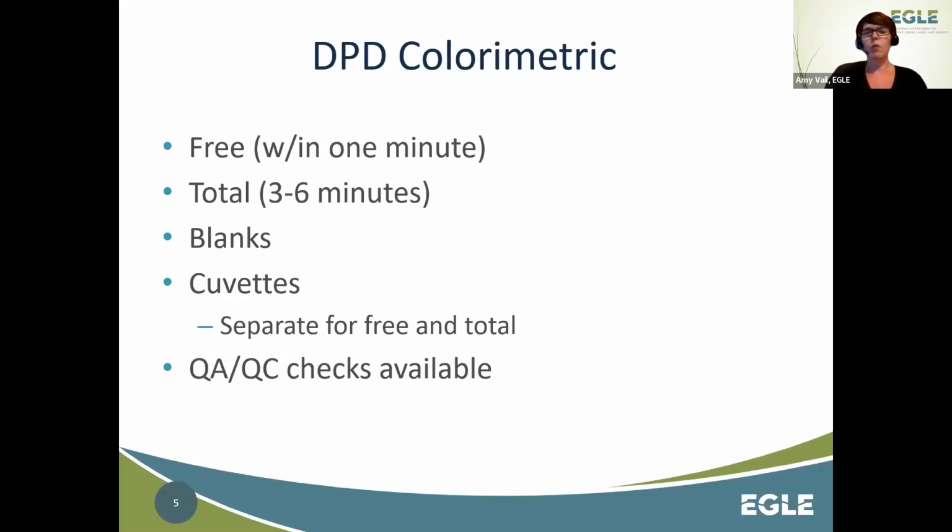And so when you run that blank in the colorimeter or in the color wheel, you're saying this means it has nothing. So even if it's a little yellow tint and then your sample has a little yellow tint, the machine will pick up that, originally the little yellow tint meant nothing. So you want to make sure that you're always blanking with the water that you're testing.